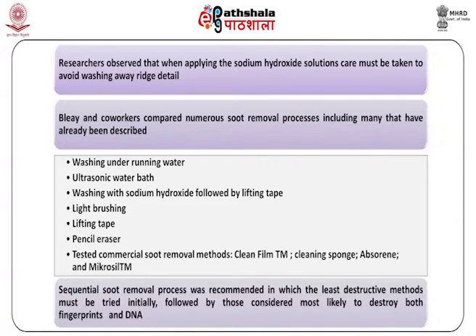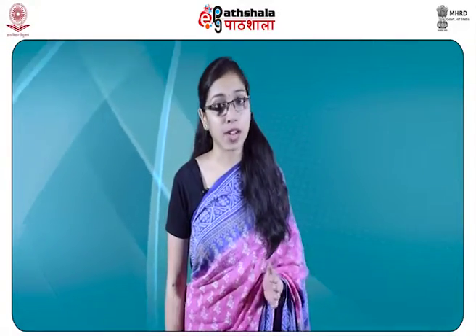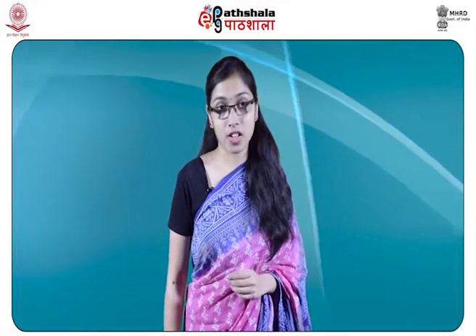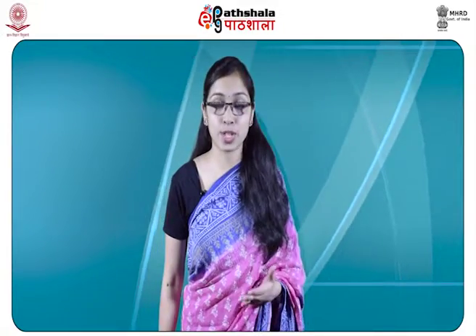A sequential soot removal process was recommended in which the least destructive methods must be tried initially, followed by those considered the most likely to destroy both the fingerprints as well as DNA. For all substrates, light brushing with a soft fingerprint brush so as to remove the loose debris was recommended so that subsequent soot removal techniques would be more effective. If the non-porous surface is flat and the exhibit has a simple shape, then application of flexible lifting tape using a roller is found to work best.